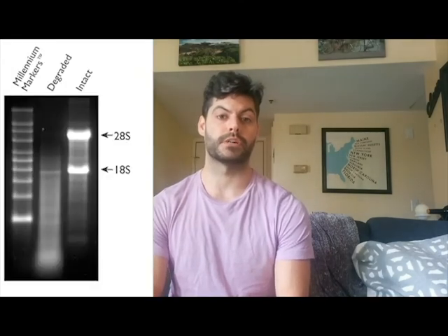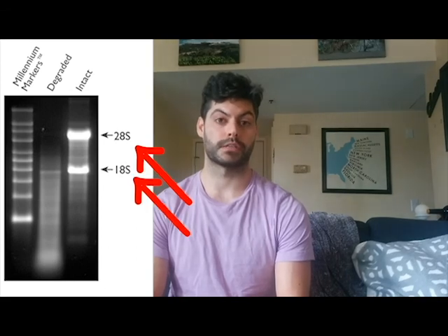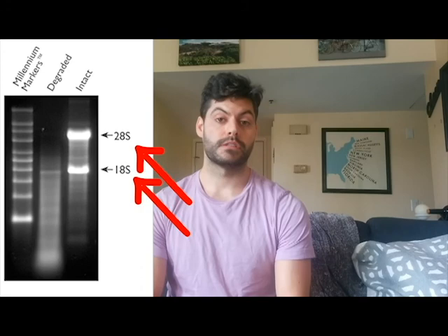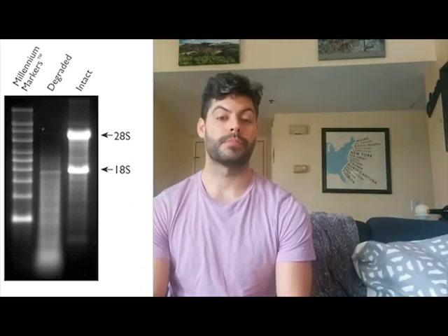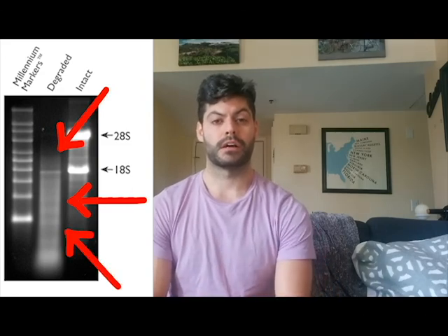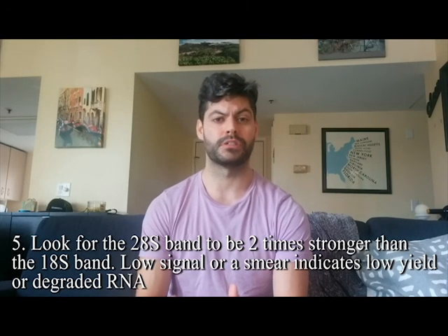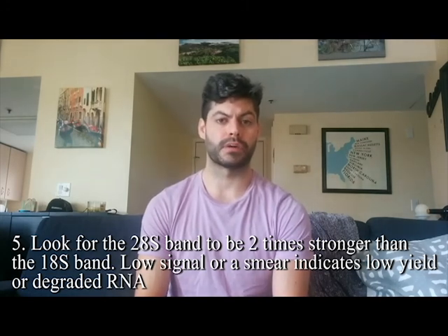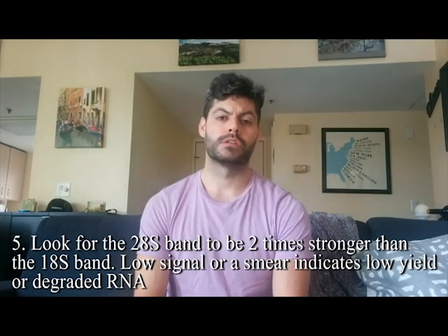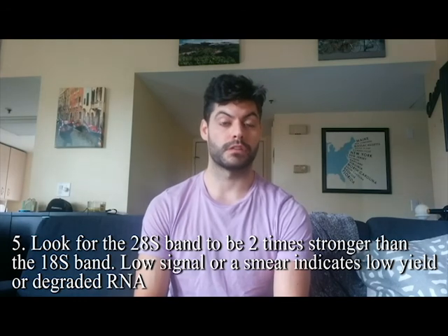The two bands to look at are the rRNA bands, which indicate how much degradation has occurred. Ideally, you want your 28S band to be twice as bright as your 18S band — that tells you the RNA is intact. If it's about 1:1, there's been some degradation but the RNA is still usable. If instead you see a smear migrating further down with no bands, the RNA has been degraded — from RNase contamination, poor maintenance, or too many freeze-thaw cycles — and you'll have to discard it and start again. If the bands look good, you can proceed with the RT reaction.